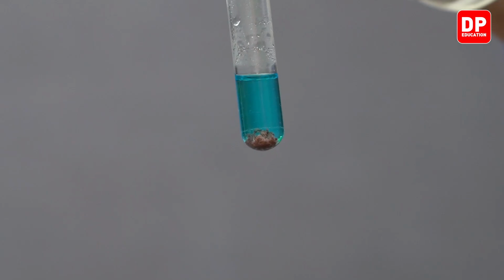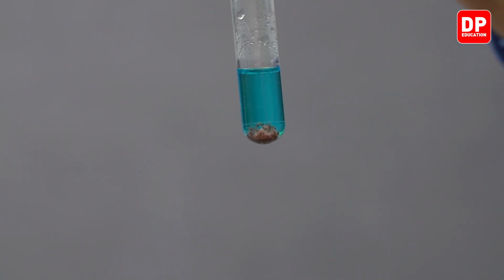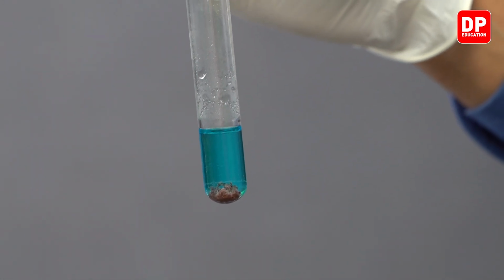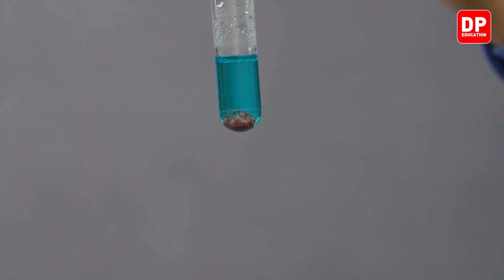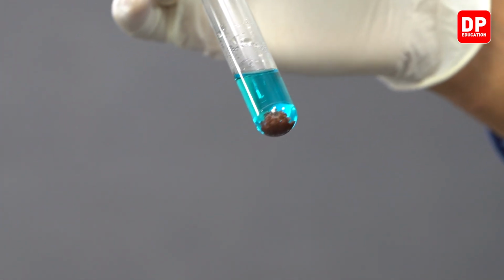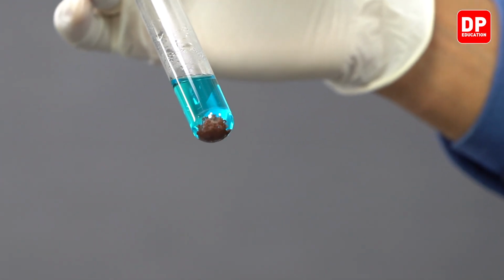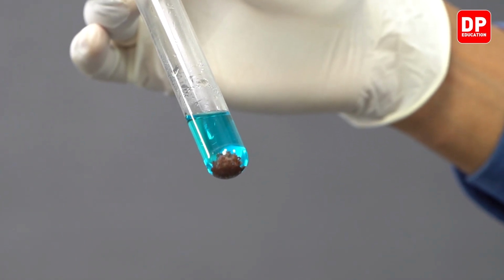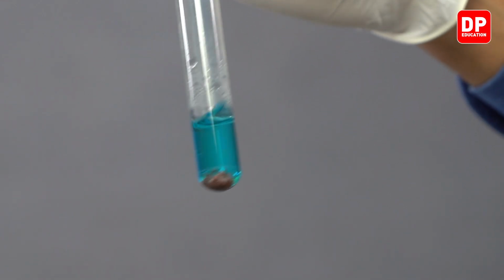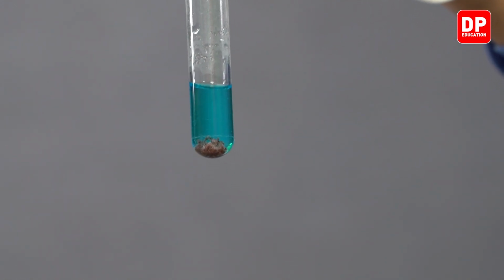The rate of reaction between Cu2+ aqueous ions and zinc was quite fast. We observed that after adding the zinc piece to the Cu2+ aqueous solution, after about 30 seconds itself, a brown color precipitate was forming. You can see here as well that a brown color precipitate is very clearly formed when zinc was added to the Cu2+ aqueous ion solution. So let's mix it and observe the color of the precipitate formed. You can very clearly see a brown color precipitate.